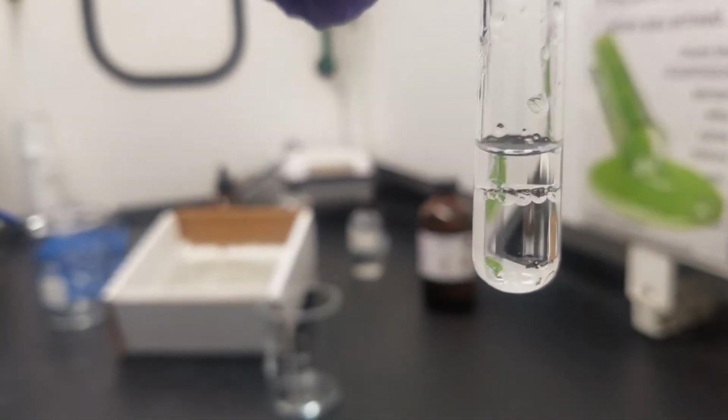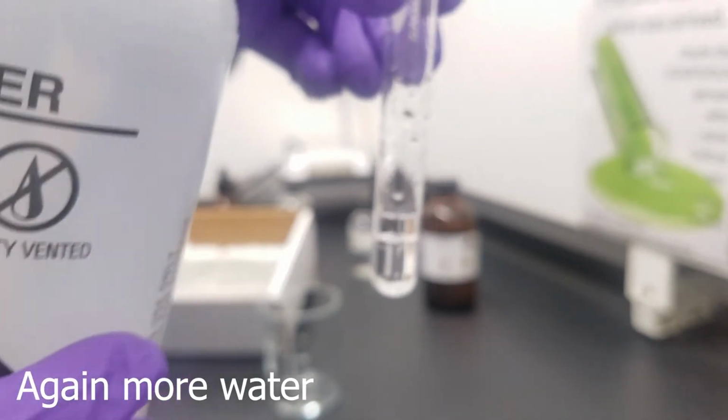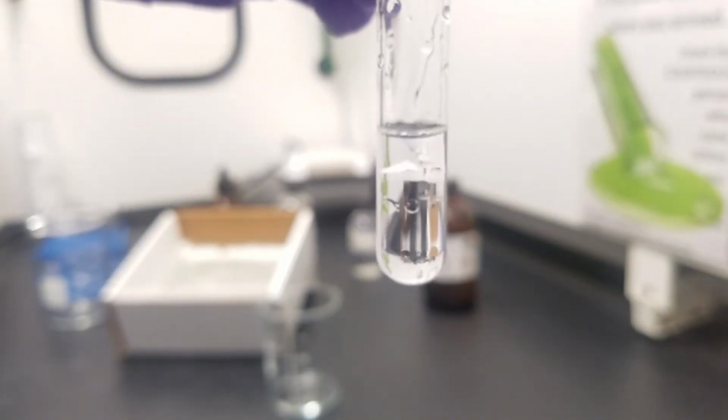We've done our mixing, and again what we'll do is go ahead and add a little bit more water. So again, we're using the water to help us identify those layers. Water is cheaper than the organic substance and less hazardous, so it's usually the better substance to add. That helps us to decide which layer was which within our individual reaction.